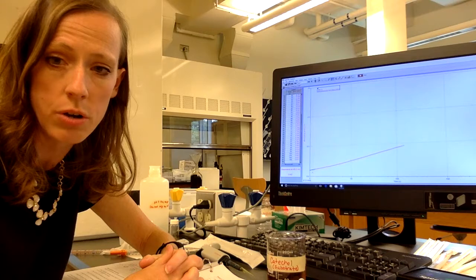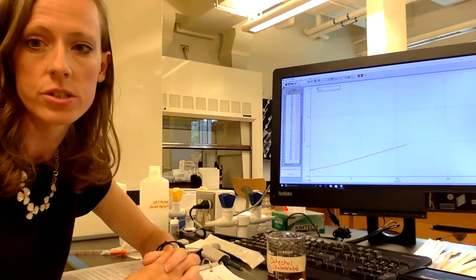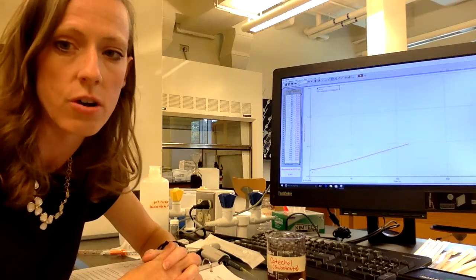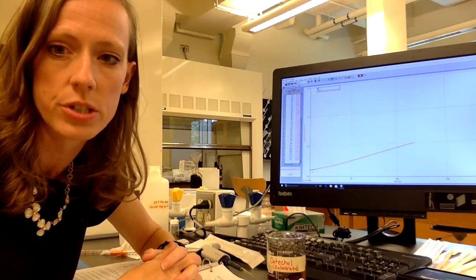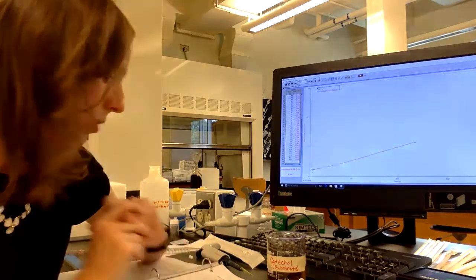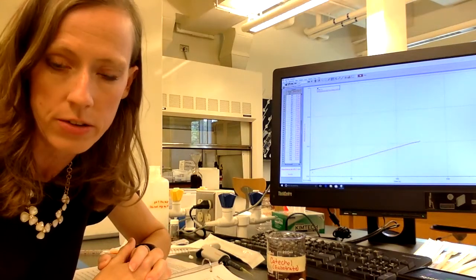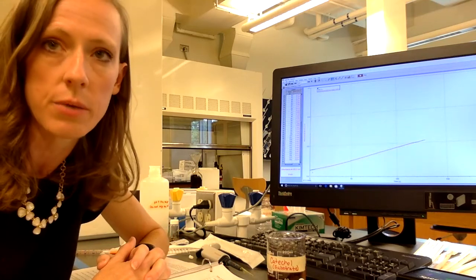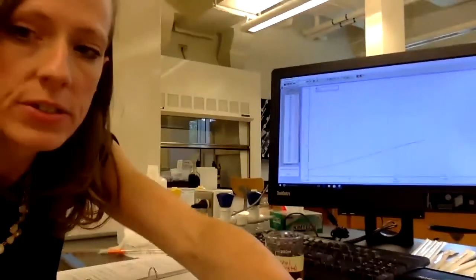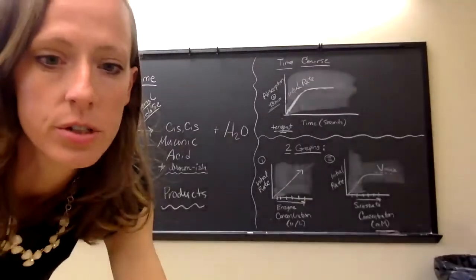I am going to also compile the data that one of the groups of students has already acquired. And so we are going to forward that to you as well, so that then you can enter that data into your lab manuals and process it just as I described to begin with the 2 graphs that you're responsible for making. So I'll bring you back to the chalkboard here and just rehash those one more time.